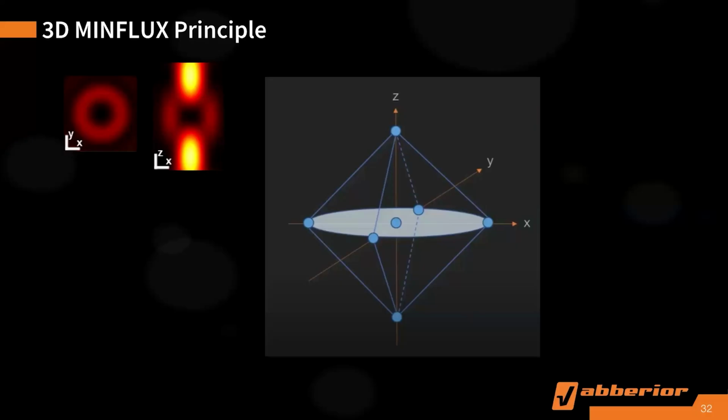And then the 3D donut moves to these 1, 2, 3, 4, 5, 6, 7 positions, right? 4 are on the equator of the sphere. 1 is the center, 1 is at the North Pole, 1 is at the South Pole. So it is jumping here, here, here, here, there. Here again, we used a deformable mirror, as I explained to you in the Mirava presentation, to make the perfect 3D movement. Okay. So from the instrumentation level, from the technical level, it is very high-end, cutting edge.